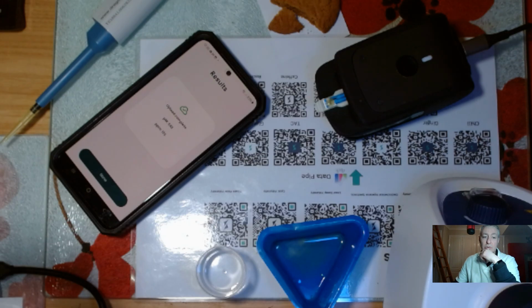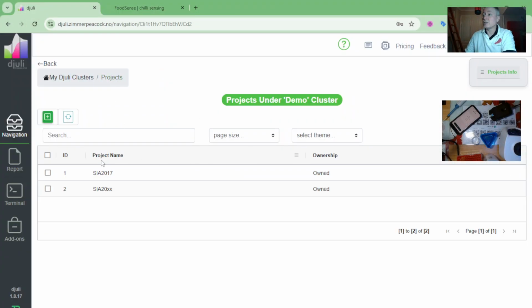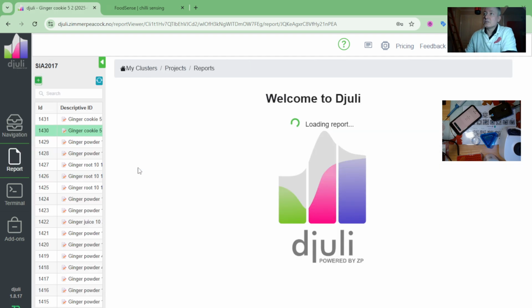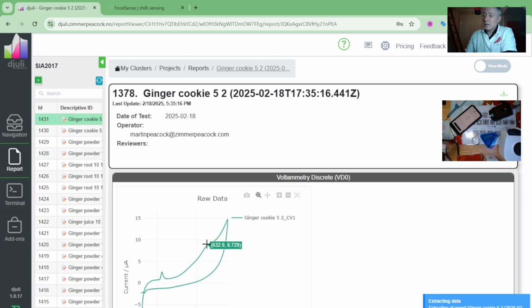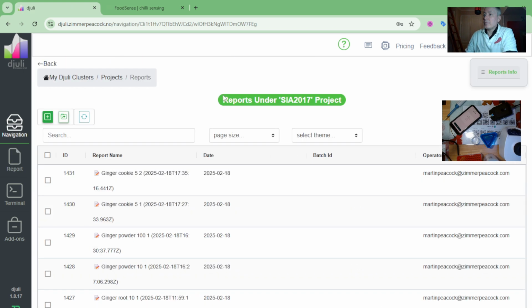What's really cool about this system is that it doesn't just give you a number. We can also get traceability on the data. If I do a refresh here, I can look at my data, and it will be quite small peaks because this is only 175 ppm. But I can see the peaks here for peak 1, peak 2, and there's just a wave here, which is what we call peak 3. You can see us picking up the gingerol peak here.